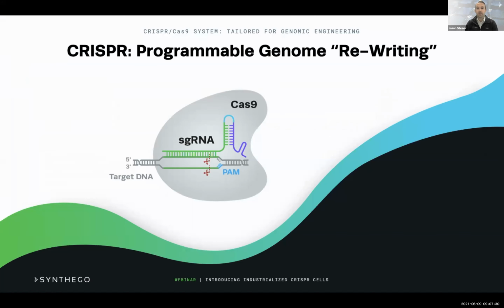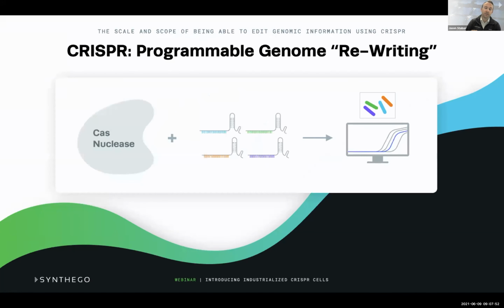So this is an image that may be familiar to many. It's the Cas9 CRISPR system showing the nuclease, Cas9, the target DNA, and really the flexible component or the guide RNA, which is the programmable component. CRISPR is pretty unique as a genome engineering system in that it genuinely is a programmable system.